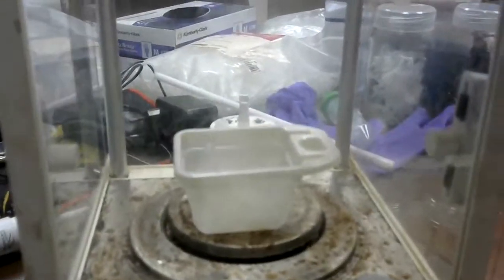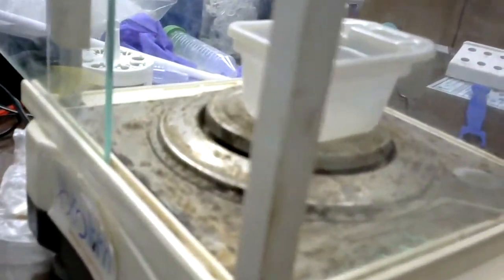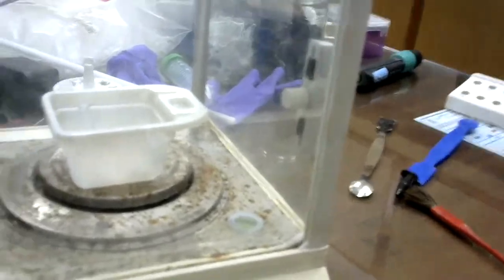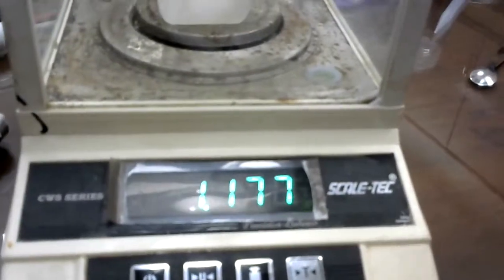You can open the chamber from here, or from this side. After putting the materials, close it from all sides and see the reading, so that after some time the reading will be stable, and that reading only you have to measure.